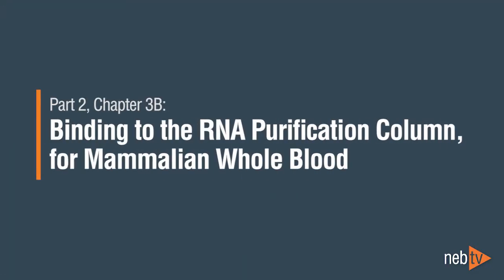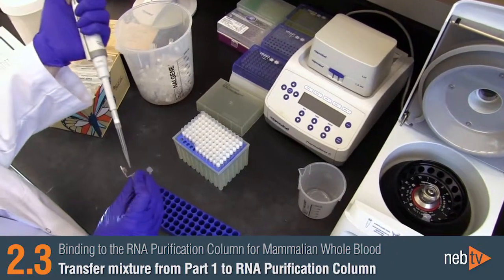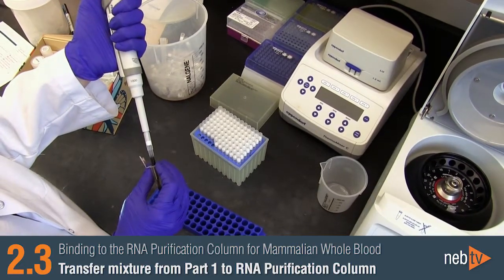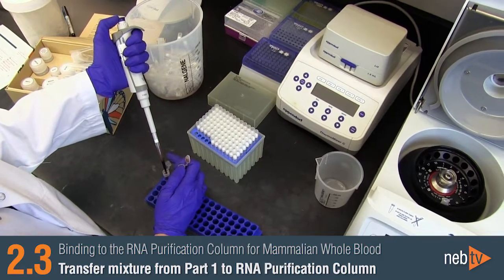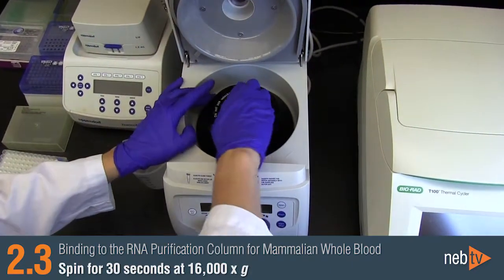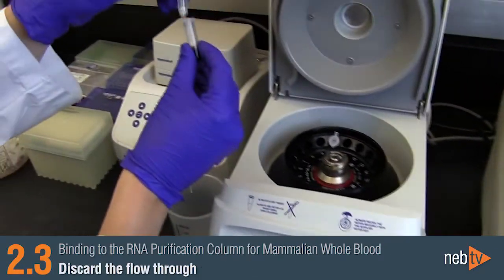Binding to the RNA Purification Column for Whole Blood Samples. For whole blood samples, transfer the isopropanol sample mixture from Part 1 to an RNA Purification Column (the column with the dark blue ring) and spin for 30 seconds. Discard the flow-through.